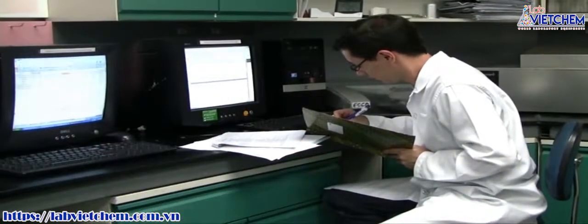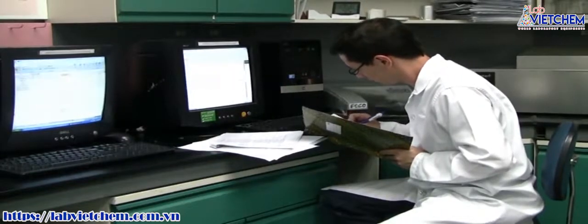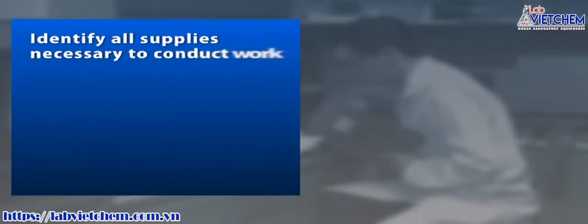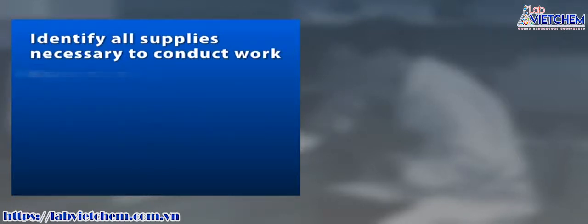Prior to starting work, you must carefully assess the risk of the work against the laboratory's policy and plan the items and steps to be used in your procedure. List all the items required for your work, including equipment, cultures, media, and other materials. Your list will help you prepare the necessary items before starting work.